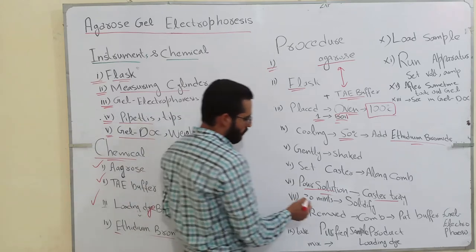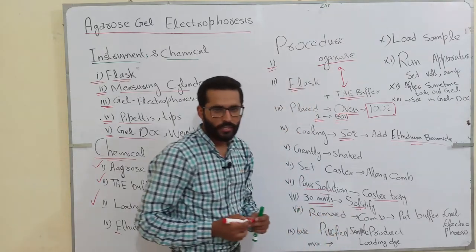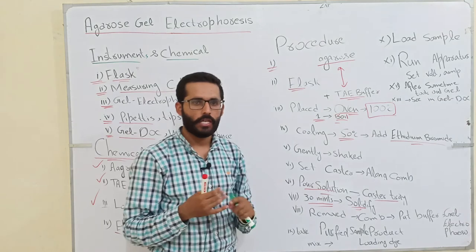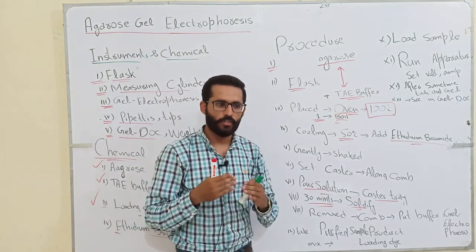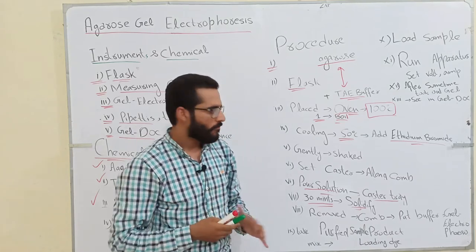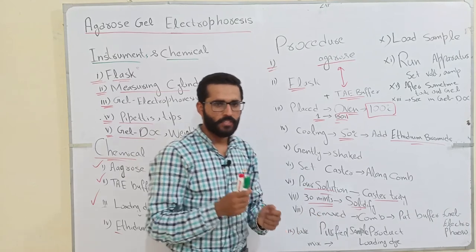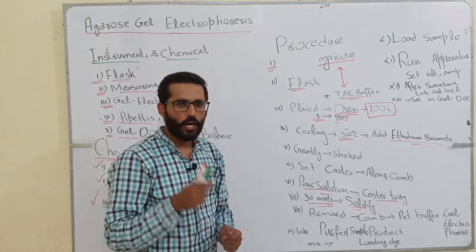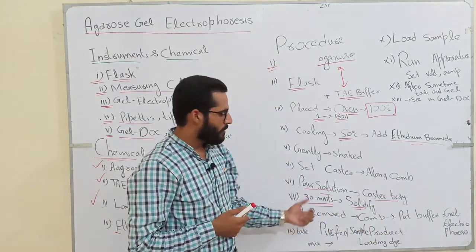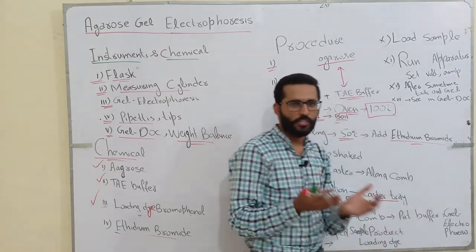For solidification, we give 30 to 40 minutes — it depends on how much time you give: 30 minutes, 35 minutes, or 40 minutes. When the gel solidifies, you take out the combs from the gel and add buffer solution into the gel electrophoresis apparatus. When we remove the combs, they create wells in the gel, and these wells are used for sample loading.